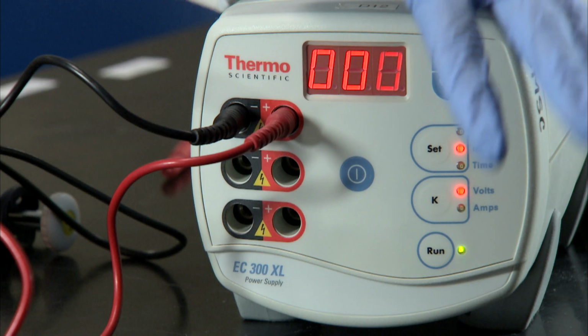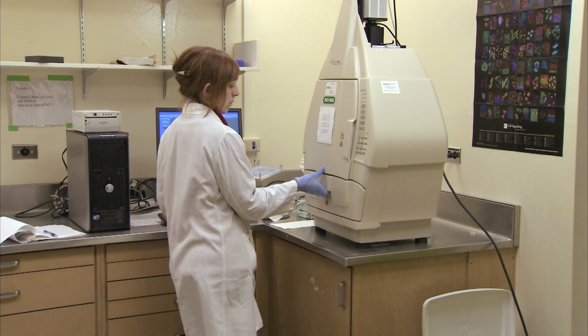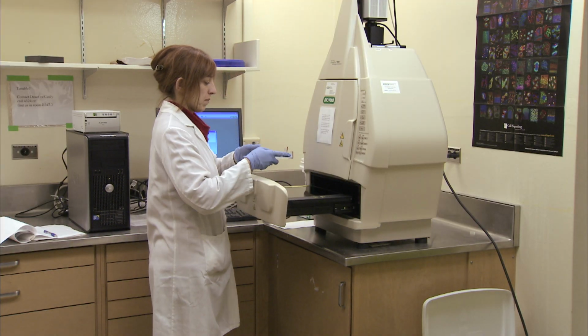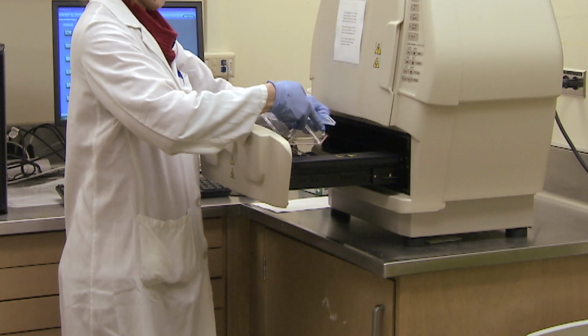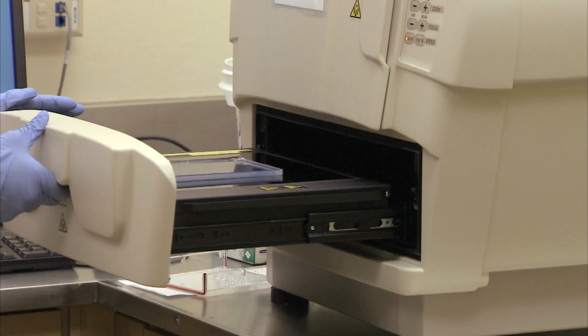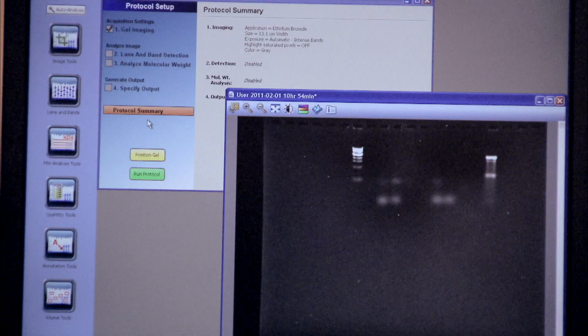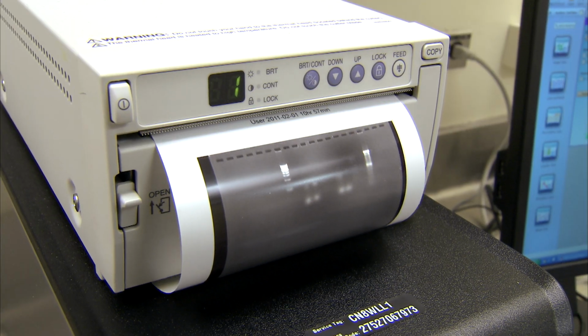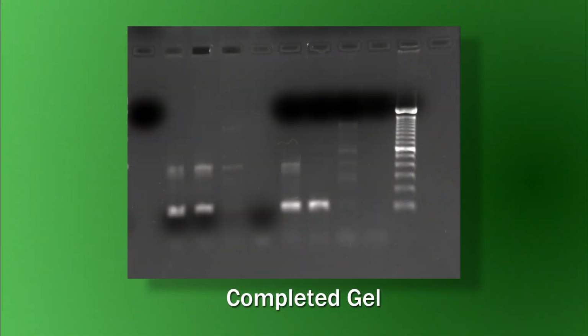After the gel has run for an appropriate length of time, the power is turned off. The lid is removed, and the gel can be carried to a documentation station. This gel is placed on an ultraviolet transilluminator contained within this gel documentation system. Using the size standards provided by the ladder, the band migration distances can now be measured to allow each fragment to have its size determined.